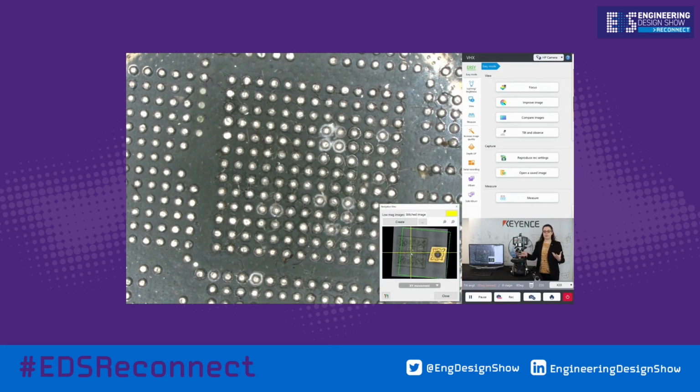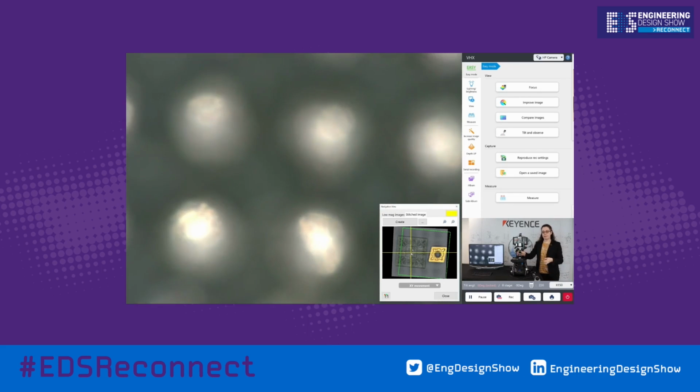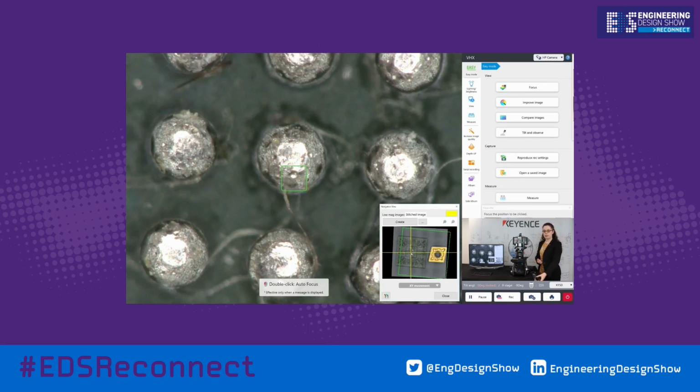Now, this is fine. I can get an overall image, but I want to get much more detailed and look at exactly the shape and the size of the balls on this array. Now, as I zoom in, I'm going to lose focus, naturally. All I need to do is just get close enough to the focal plane that I can see what I need to see. And then we're going to build up a 3D stitch.